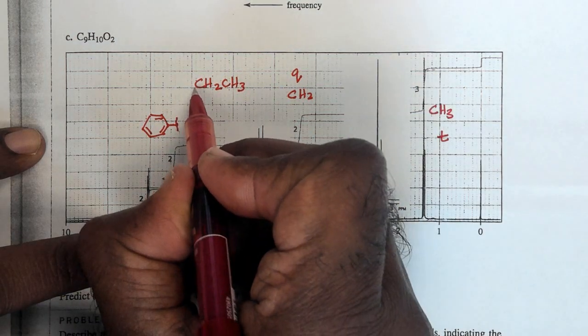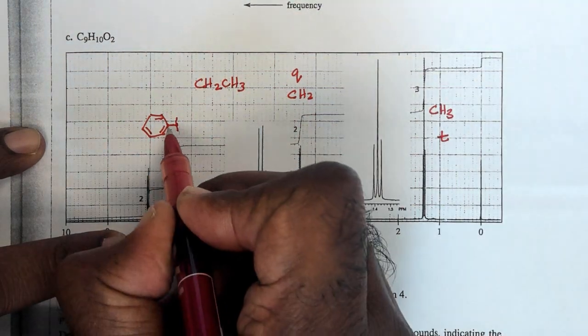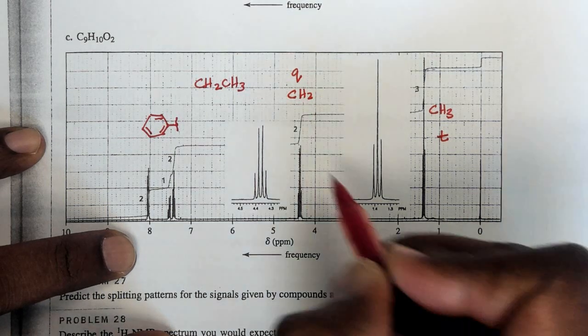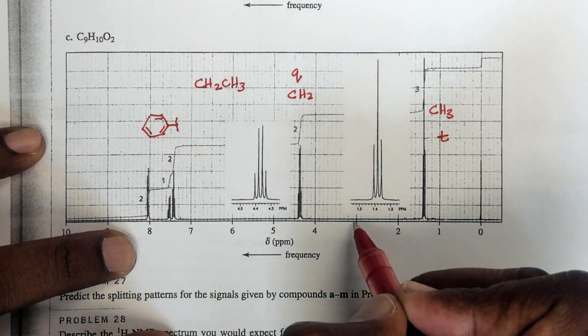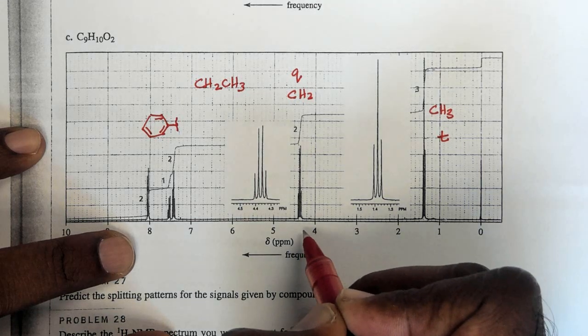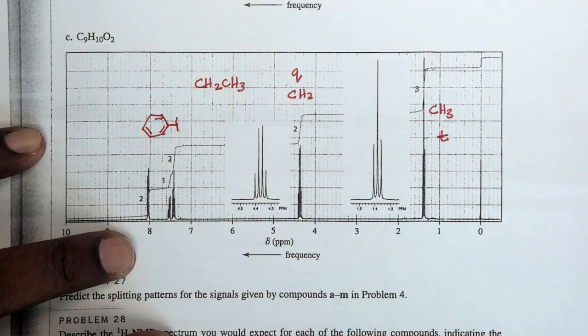Now something is de-shielding this carbon, and if it was just this aromatic ring, we saw earlier that the chemical shift is around 2.8, 2.9, or even around 3 sometimes. But this has shifted way down to 4.2. Much like when a heteroatom is joined to a protonated group, such as oxygen, or chlorine, or bromine.